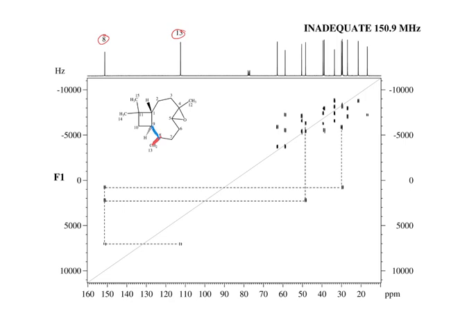That would likely be, I think, because it's tertiary, probably further downfield than 7. So it would likely be here, 8 to 9. And then the other one over here might be to 7. Oops, I should have made that a different color.